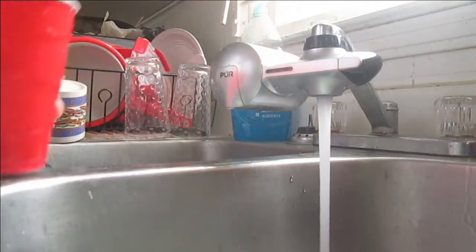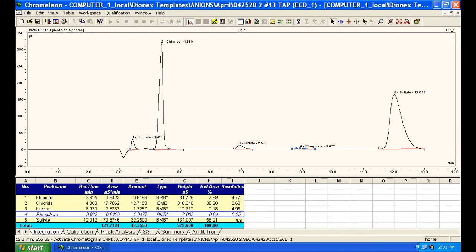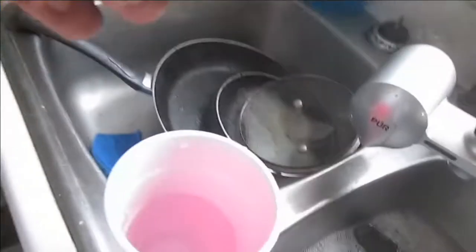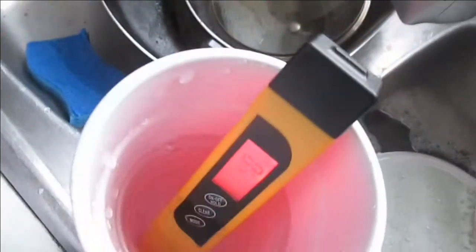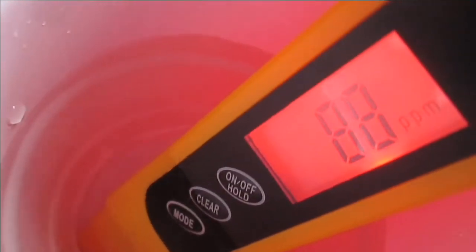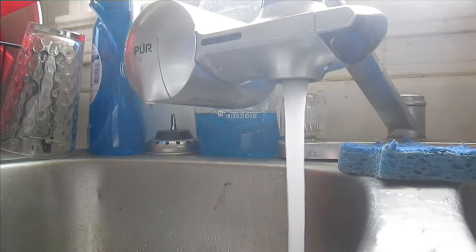So here's my tap water again — take a look at the number of total ionic species detected in ppm: 36. Now compare this with the result I obtained earlier from the anion analysis: 48. So 36 and 48 is 84. Here's the TDS meter and conductivity reading from the same tap water: 88. So we can determine about 95% of the total ionic content of this water.